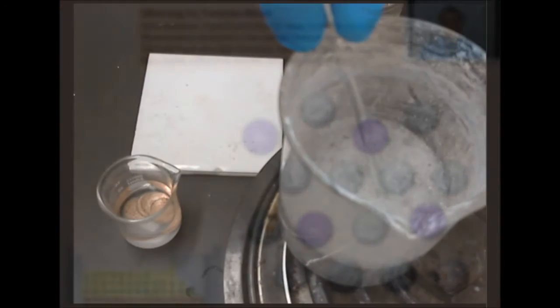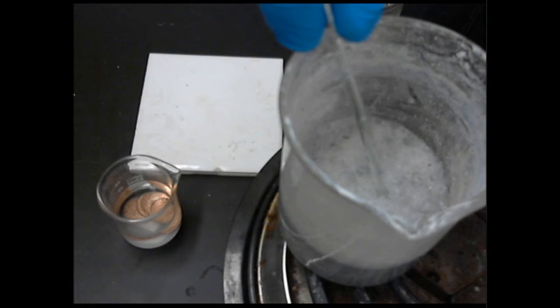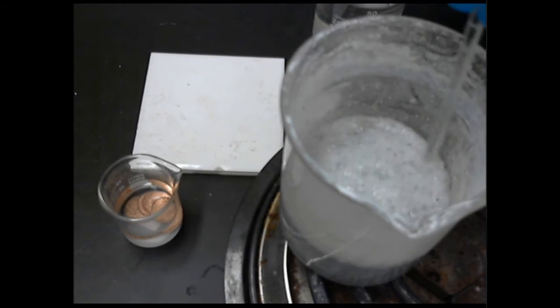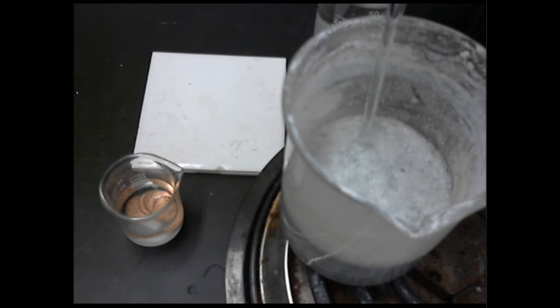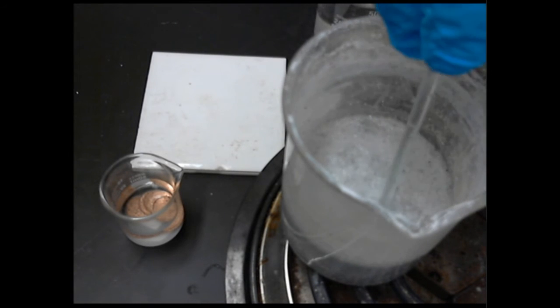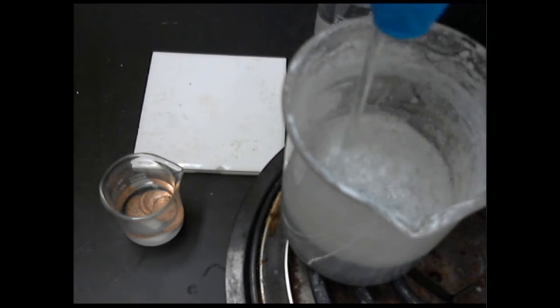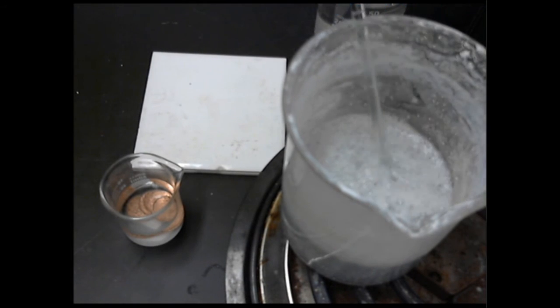So here I have the setup for the transition metals lab. I have my zinc acetate. I actually use zinc acetate instead of zinc chloride because it gives off less fumes and is a little bit easier to take. I have my zinc acetate boiling in this very dirty beaker that I have dedicated to the task of boiling zinc acetate. It's very, very difficult to clean this out afterwards.